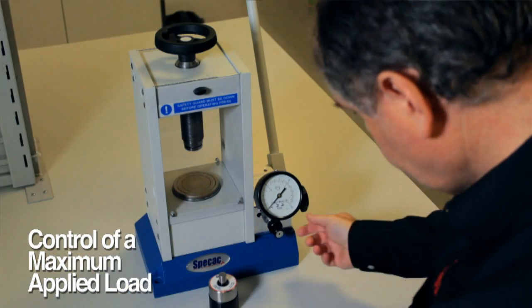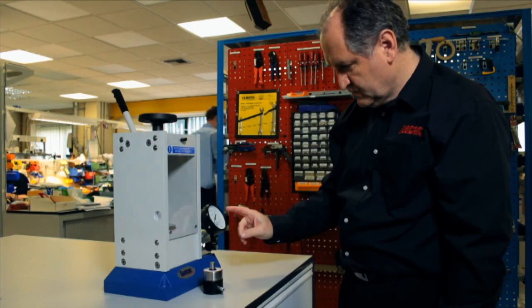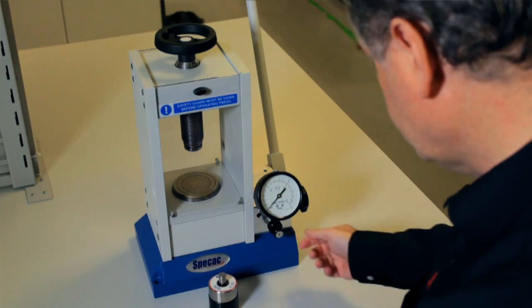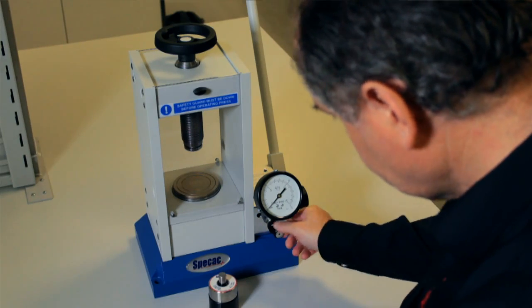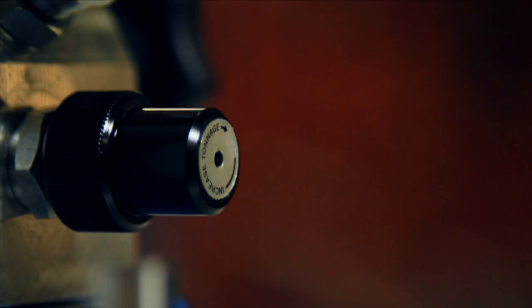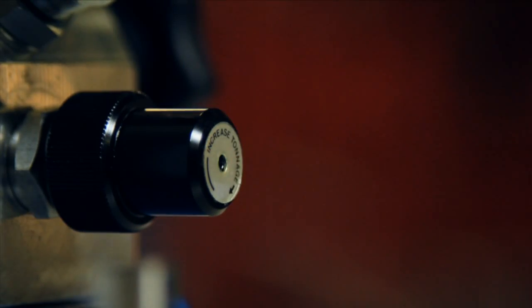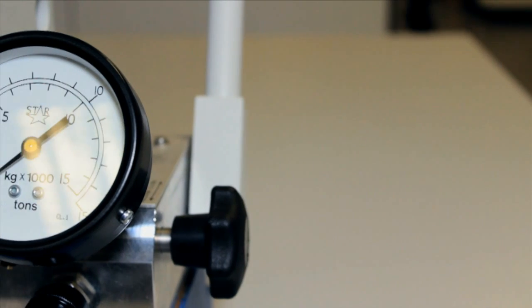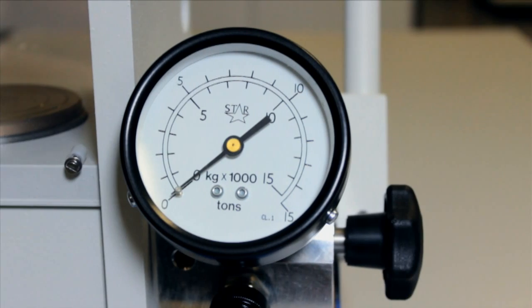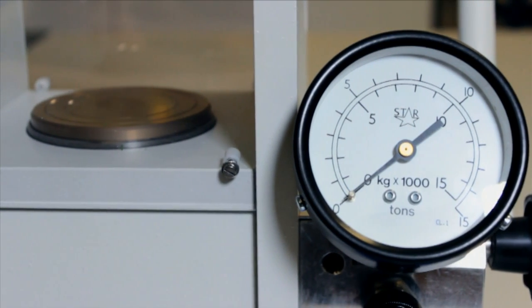Beneath the tonnage load gauge there is a pressure relief valve which may be set so that any load between 0 and 15 tonnes is the maximum load that can be obtained. The relief valve screw cap knob can be rotated clockwise to increase the maximum oil pressure and hence the applied tonnage load, or rotated anti-clockwise to decrease the pressure and the applied tonnage load. This is a useful feature for pressing applications where a maximum load limit is required — for example, 10 tonnes is the maximum load limit for use of a 13mm evacuable pellet die.